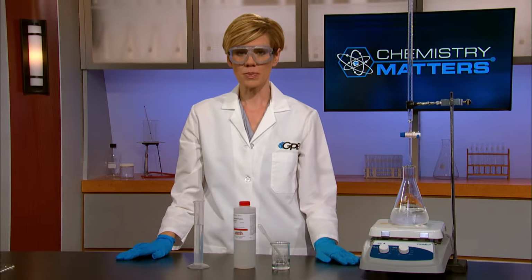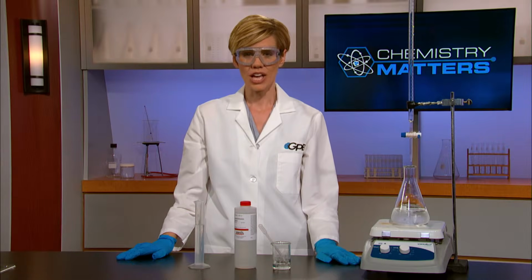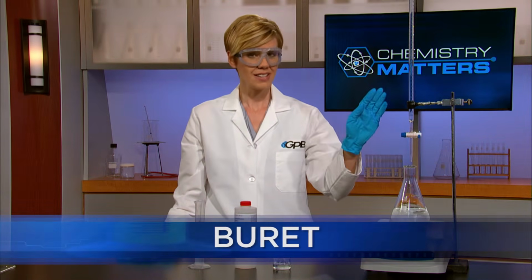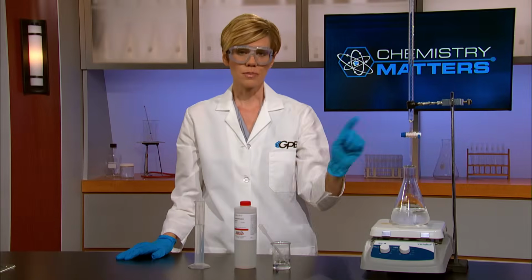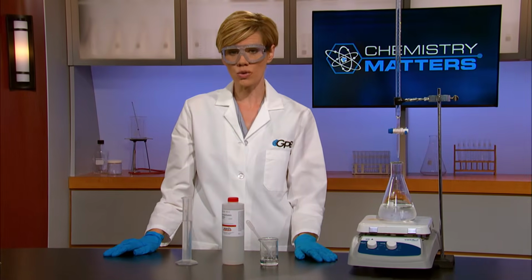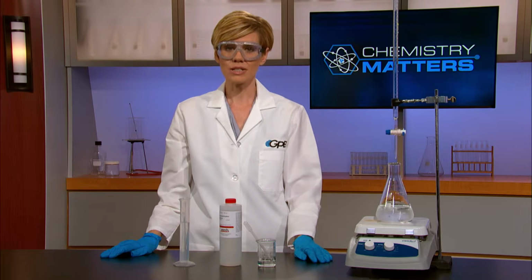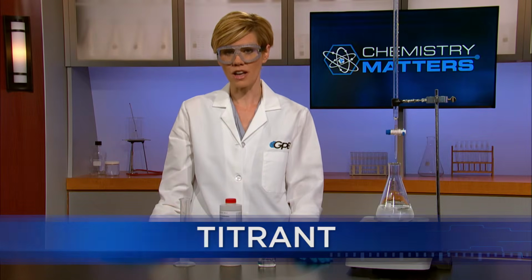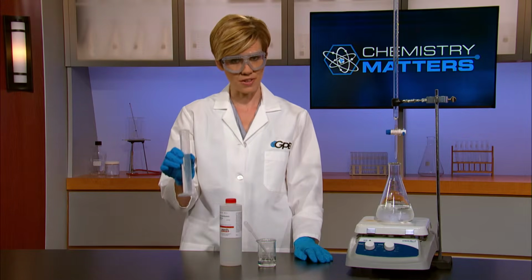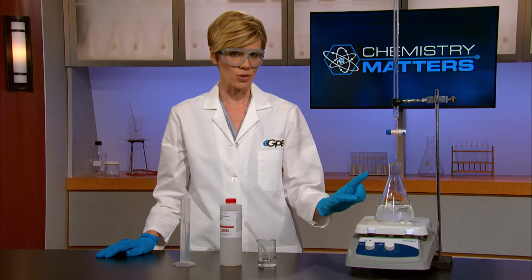Let's say our laboratory has been given a sample of an unknown base from the site of a chemical spill. You'll be the chemist who has to figure out how concentrated it is. You'll use a special tool called a burette that's like a graduated cylinder with a dispensing tip called a stopcock. The burette will hold a known volume of a known concentration of acid, like the acetic acid in my burette. The chemical in the burette is often called the titrant. You'll carefully measure a volume of a base of unknown concentration, in this case 50 milliliters, and place the solution of base in a flask right under the burette.